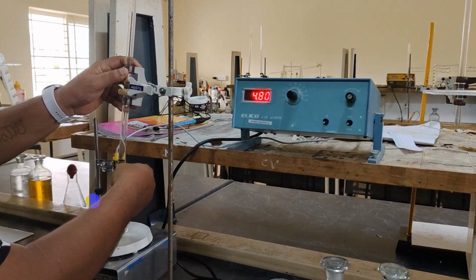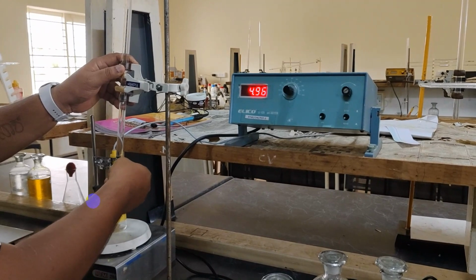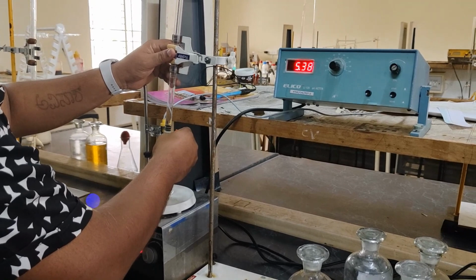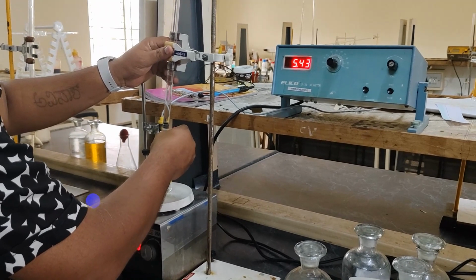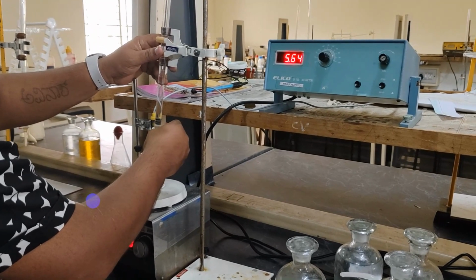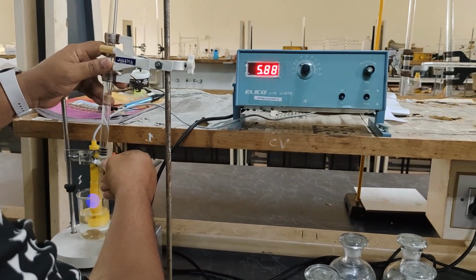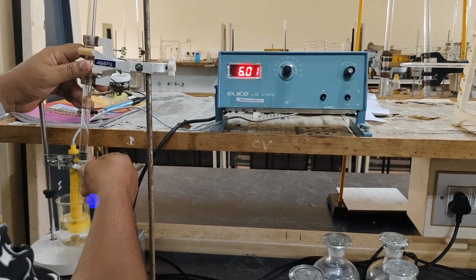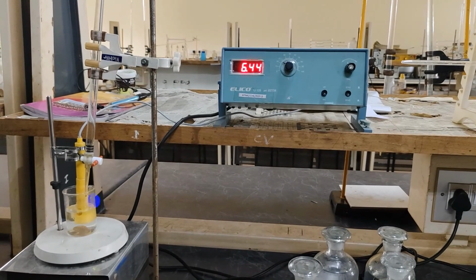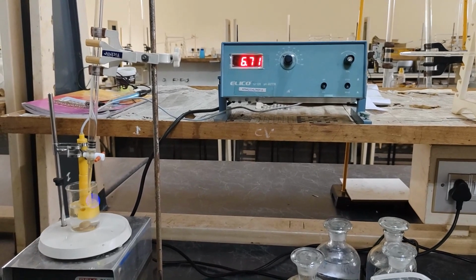So for each increment of 0.5 cm3, we are going to record the change in the pH until we observe a sharp change in the pH. There should be a sharp change in the pH, meaning a dramatic increase in the pH. Now you can observe the change in pH happening here. Which was somewhere around 5 is now increasing to 6.5, and this might go up to 8 or 9.